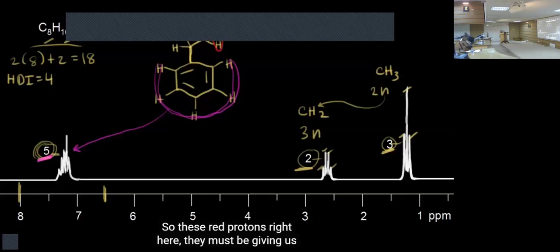So all others are technicians, they do things as per their experience. But you know your compound very well. You know from which plant, which species, which genus you are working and isolating these compounds. So you have some idea of the type of skeleton and the type of spectrum that you are expecting, right?